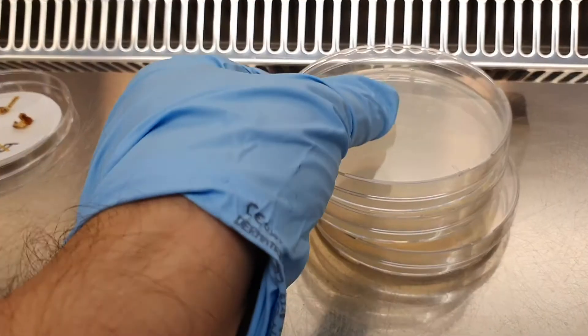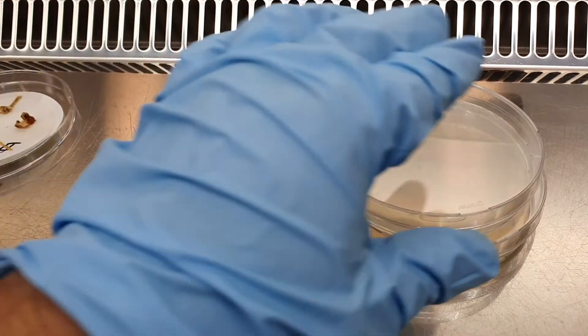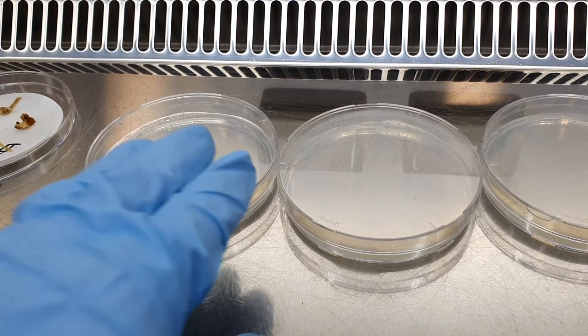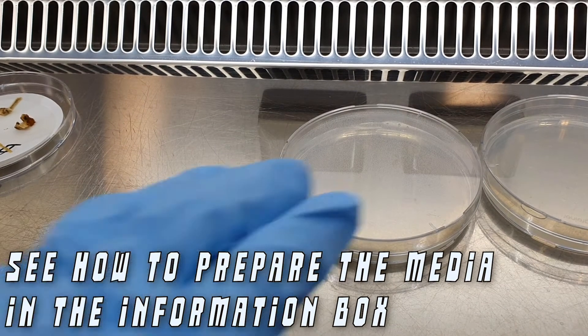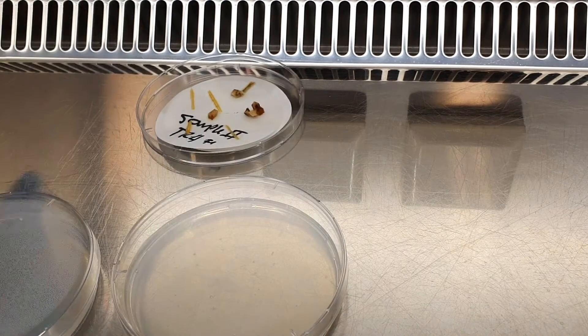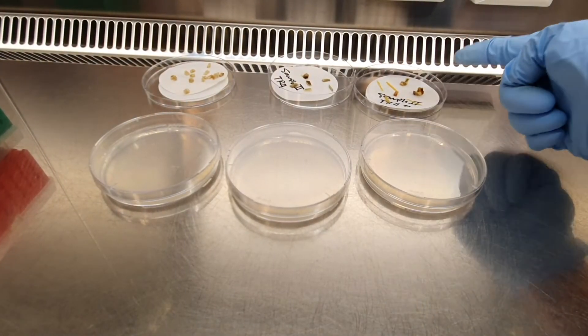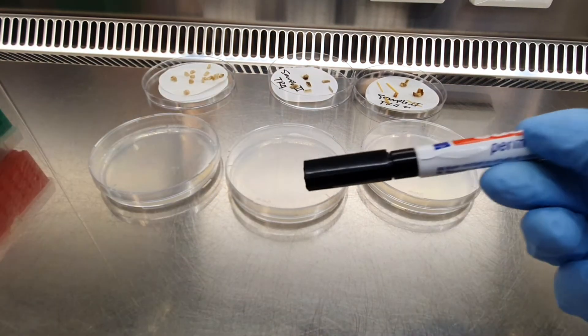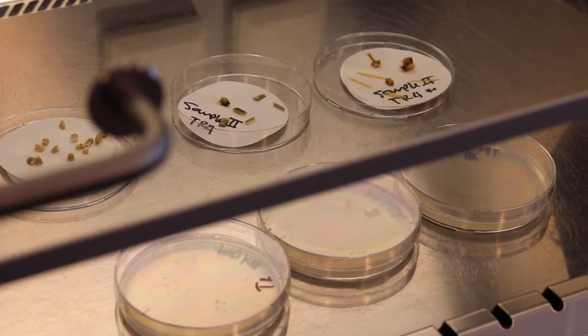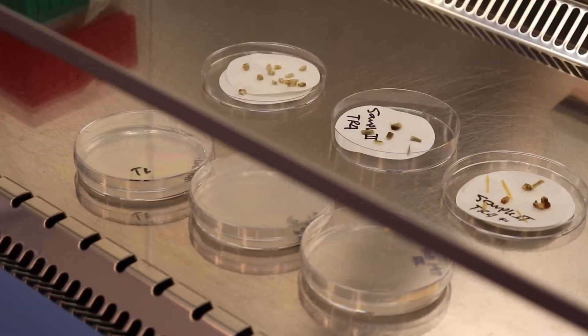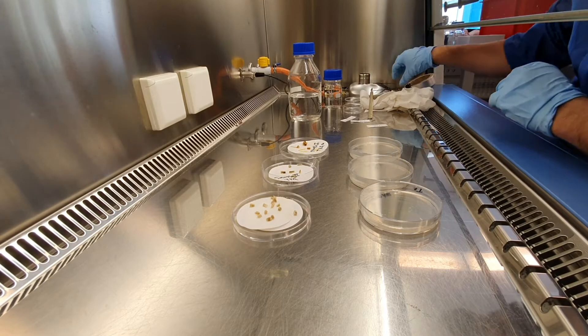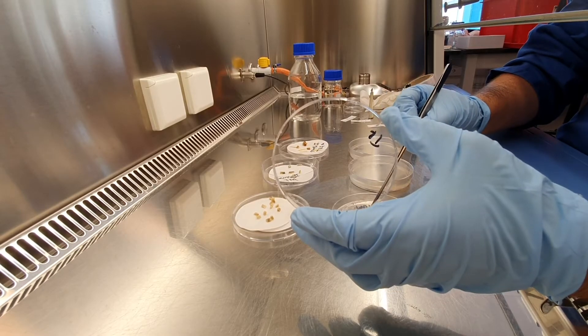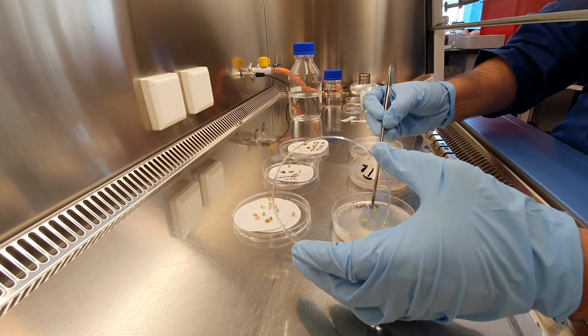Now, when the samples are ready and are dry, it's time to transfer them to media. I'm using here PDA with streptomycin. The information on how to prepare the media, you can find it in the information box. Also, sometimes I use Comada media for more difficult samples, like for example soil. What we are going to do is just transfer those pieces there. Don't forget labels. If you don't have labels, use a marker. This is very important. Now, with clean tools, we are going to transfer those little samples to the media. You can put as much as you want, but I recommend to put no more than five or six pieces per plate.